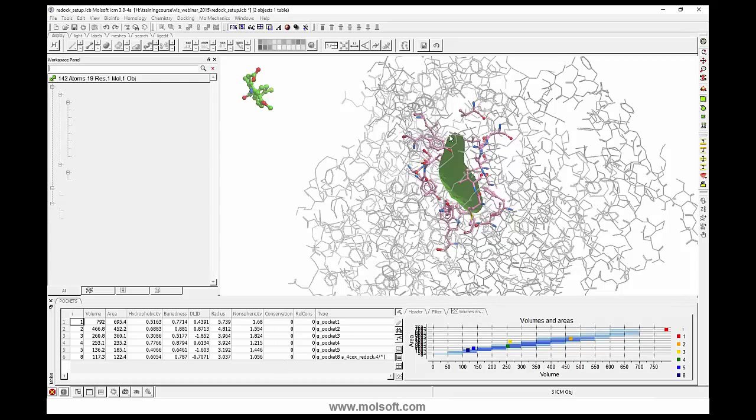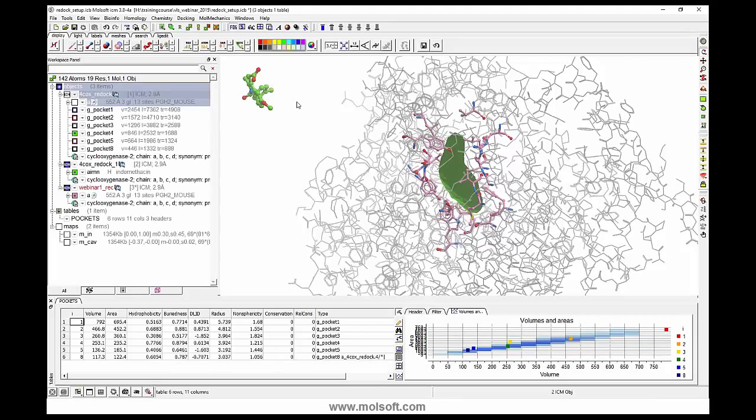And we had a question: in the presence of the ligand, will the binding pocket site vary? Yes. So if the ligand is in there, in the tools panel you can choose to ignore all ligands and het atoms, and it will just find the sphere. So you don't have to physically move the ligand out if you don't want to do that.